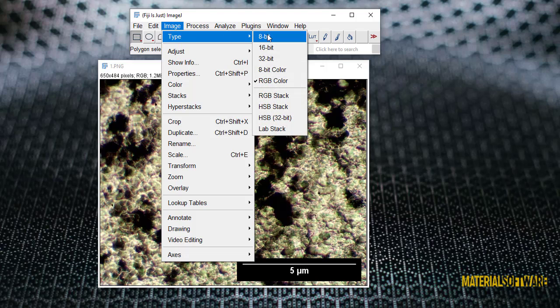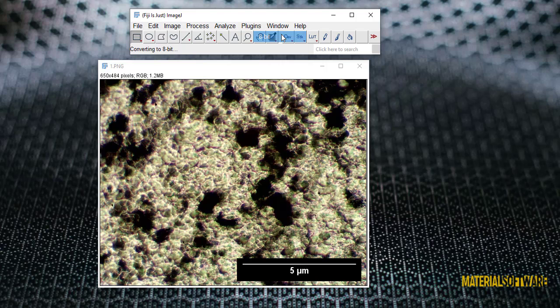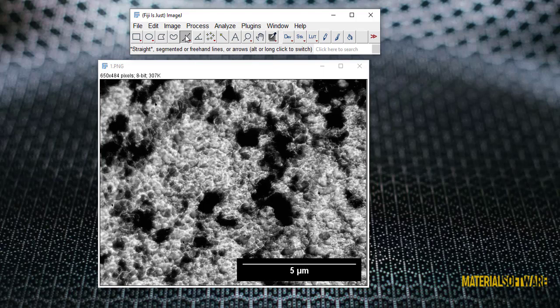Next, draw a line with a length of 5 micrometers based on the scale line of the image. Select the right toolbar, hold the shift key and draw the line. The reason for holding shift is that the line we draw is drawn straight.